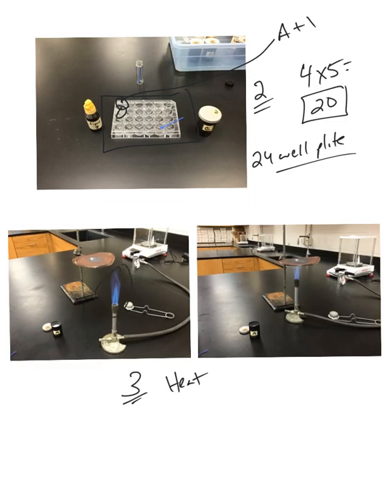You'll put a small amount, not a huge heaping amount, of the powder itself. Put a small thin layer onto the can lid. Light the Bunsen burner when it's not under the can lid, then slowly slide it underneath and heat it. Now, what does the powder do when heat is applied to it?